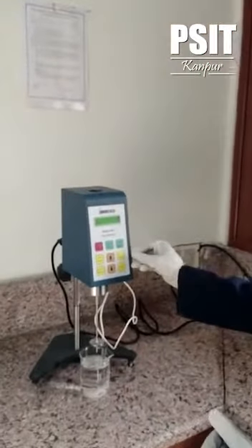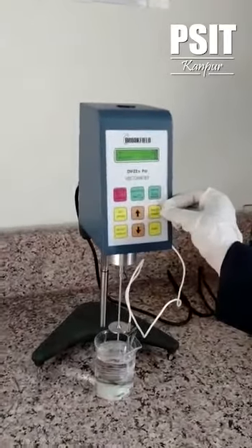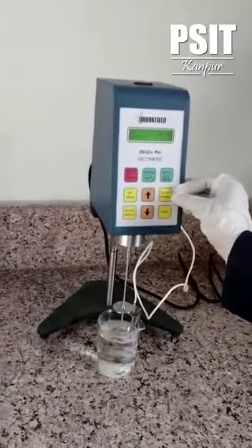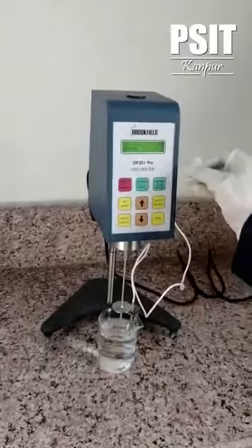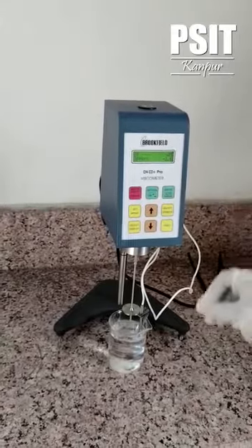In order to select the spindle, we have spindle number 3 here. To select the spindle number, you can push the button and select the spindle. It will display here. Then again push the select spindle button.